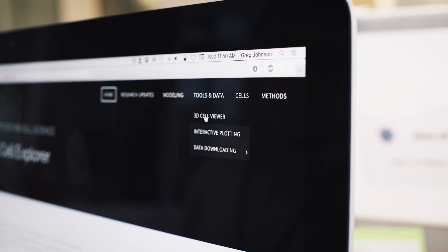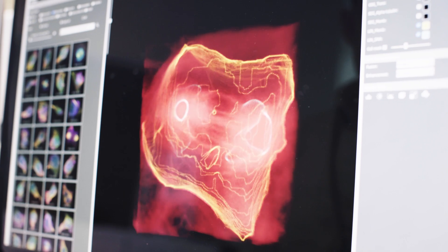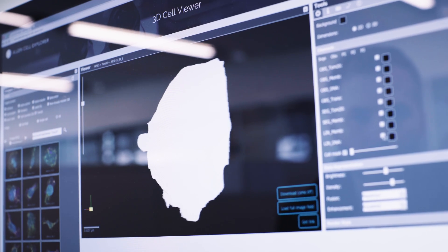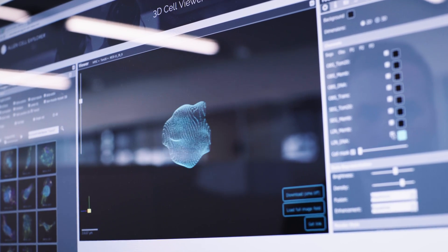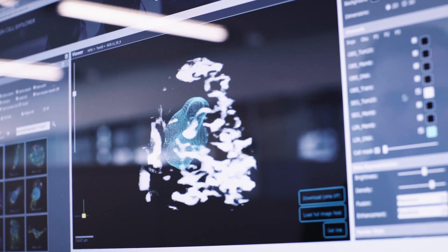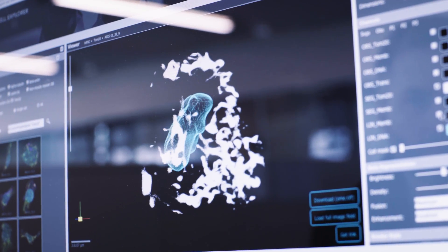The 3D Cell Viewer is a browser tool to allow anybody to come and look at our images. So you can click a button and the nucleus appears, and you can click another button and mitochondria appear, and you can observe through this 3D viewer the relationship between the nucleus and the mitochondria and the cell shape.